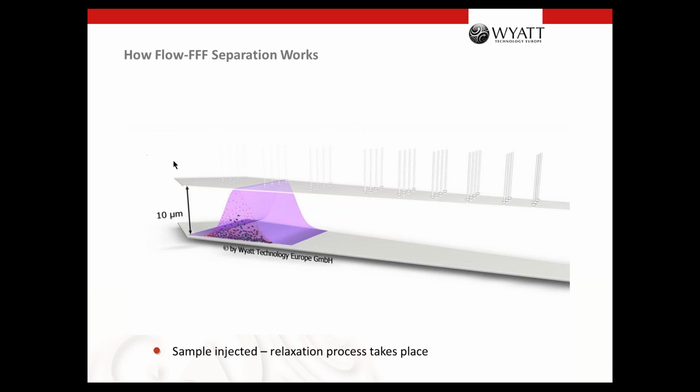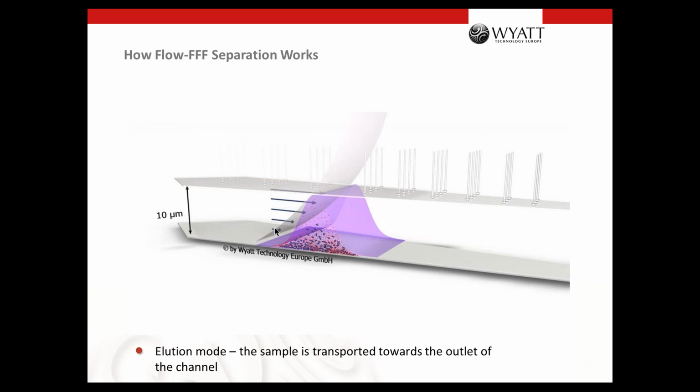When we look now at the transport flow, which flows through the channel, this transport flow is a laminar flow, and that means that near the membrane, the flow velocity is roughly 0, and the higher we are above the membrane, the higher the flow velocity is. And the strongest difference is in roughly 10 micrometers of the channel. So the total channel height is 490 micrometer, and just in this 10 micrometer above the membrane, the separation takes place, because in these other regions, the difference of the flow velocity is not high enough to achieve a good separation.